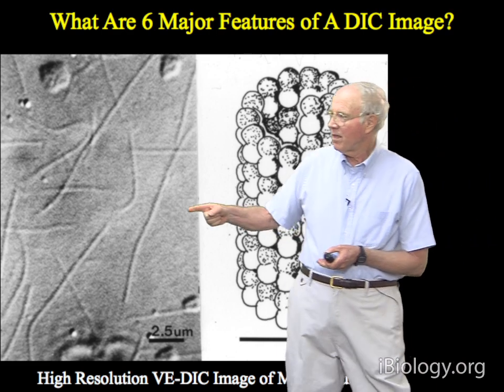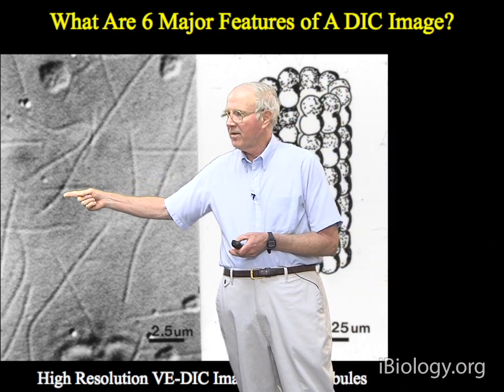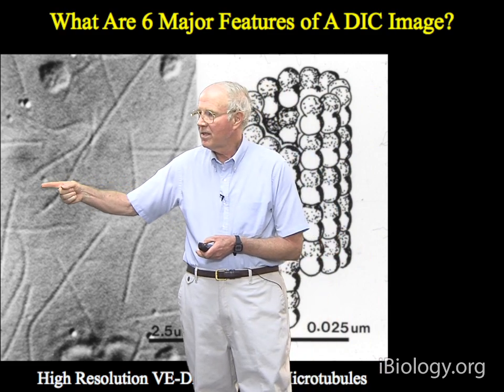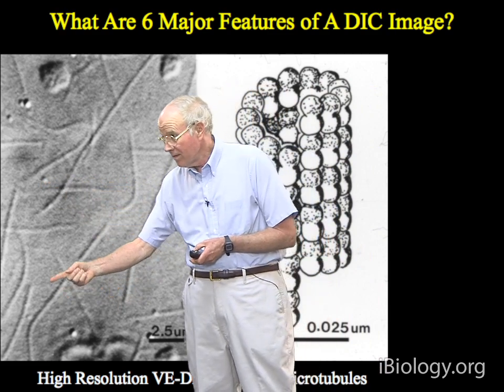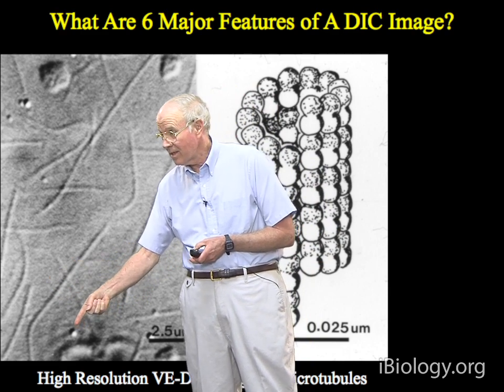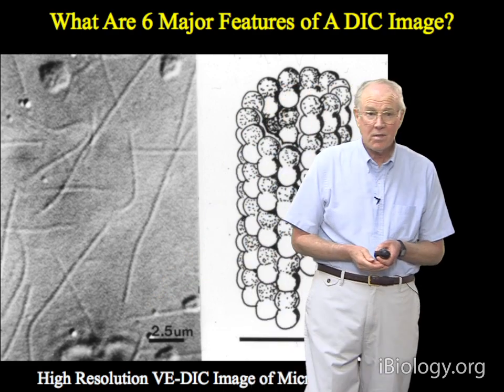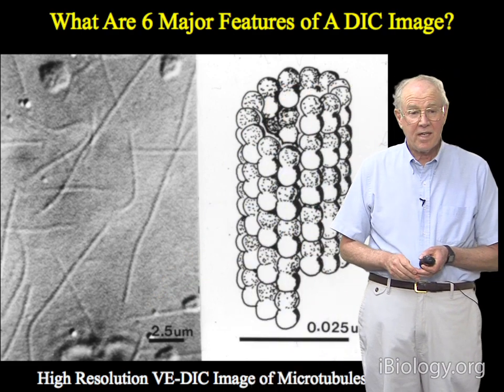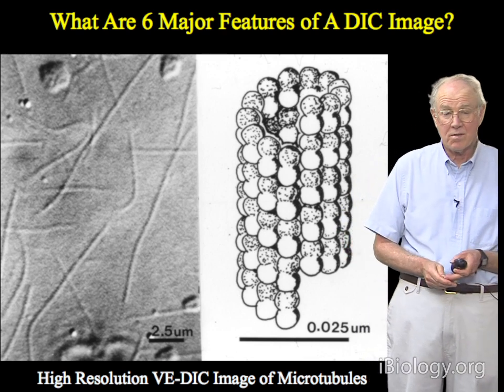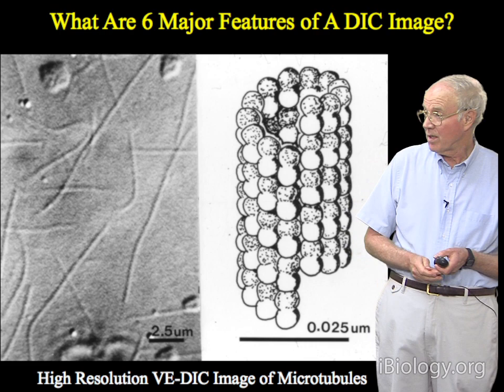And I want to start by having you look at tiny particles like this one over here, and then there's another one down over here. There's one right down there, and there's one right there. Right? And if you look at these tiny little particles, they may have a size that's even less than the microtubule. They all have the same sort of image structure.